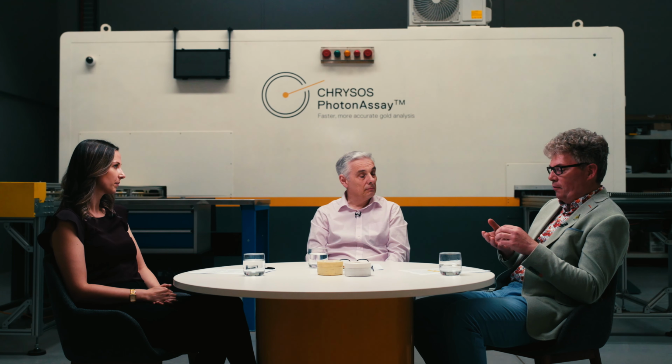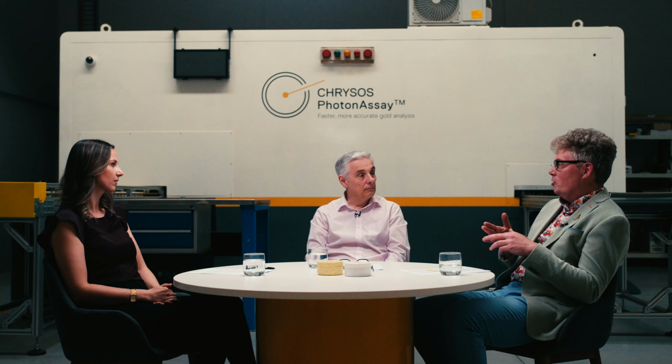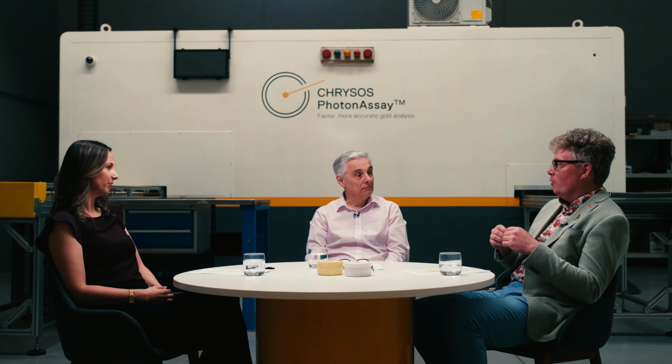And we've done a fair number of studies now where we look specifically at this question, look at precision via duplicates, and you see that the pure instrument crossover point actually happens at much lower grades than you would think. Certainly, our experience down at that sort of 0.1 ppm level, on real world materials, you're typically seeing fairly comparable performance between PhotonAssay and fire assay. And I think sometimes that's a point that gets a little bit lost. It's very easy to look at your control charts on your CRMs. It's more work to go back and look at the performance on duplicates, but it's certainly a good thing for people to be aware of.